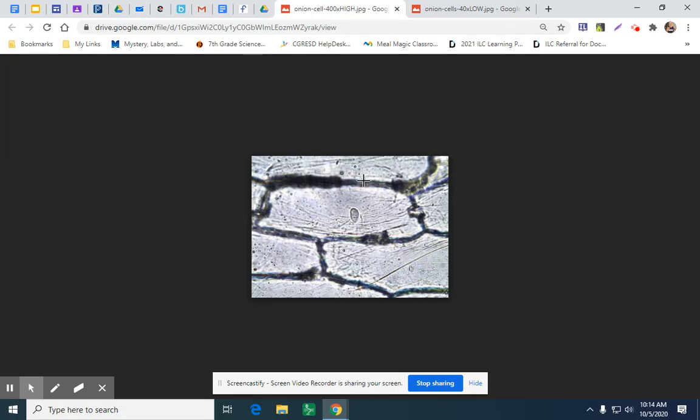You can kind of see a little bit of the cell wall, and within it you can see a little bit of the cell membrane within the cell wall. I see some different organelles in there, some cytoplasm. This is a multicellular species, so you can see the pattern that it makes. Most plant cells have cell arrangement like that.